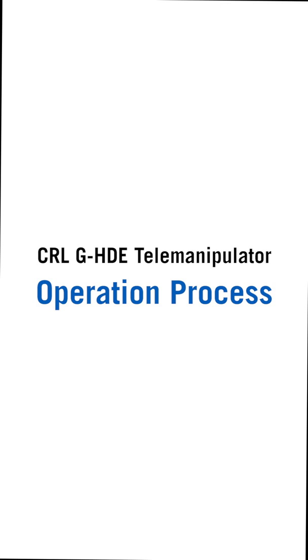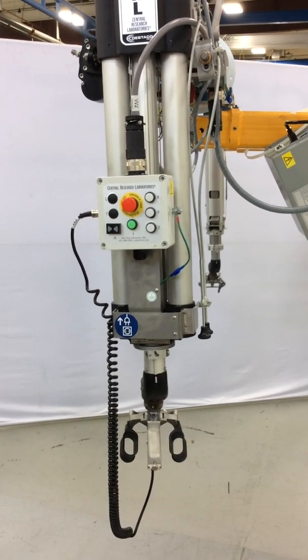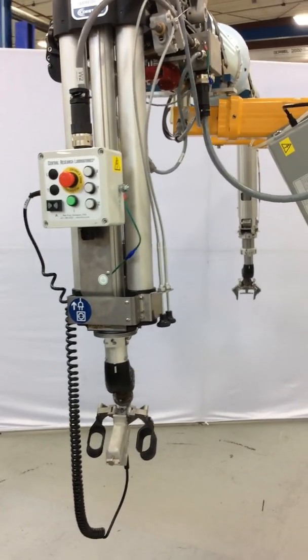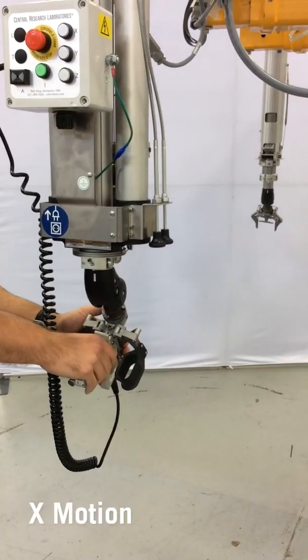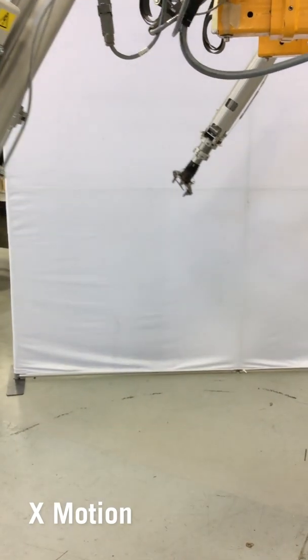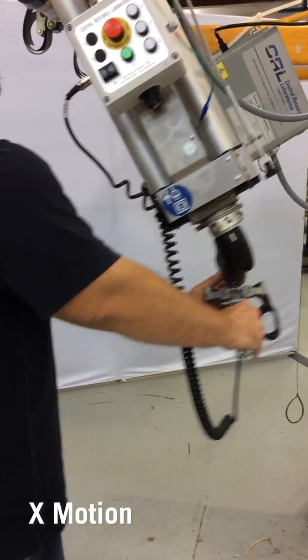We will be showing you the operating process of a model GHDE telemanipulator produced by Centro Research Laboratories. X motion is to the left and to the right. This is manual motion, input provided by the operator.